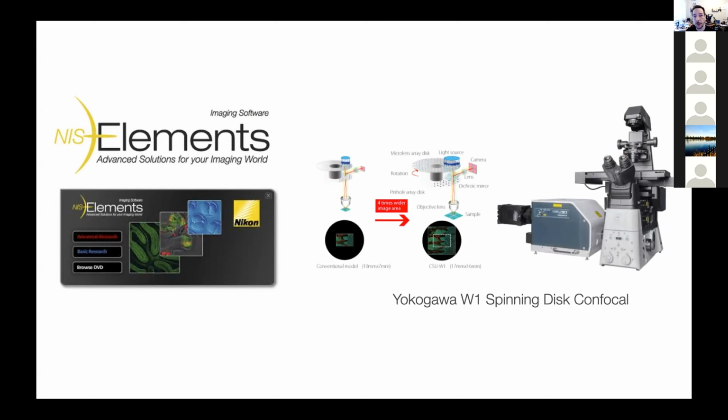And it's really a perfect system for this because it has very high sensitivity sCMOS cameras. So we have a large field of view, we've got a lot of sensitivity, and we can image optical sections very quickly in tissue and in cells. And so when you start doing things like that, you can start to think about your research in a different way. Instead of sitting at the microscope and manually collecting data, you can start to think about automation and then thinking about what it is you actually want to get from that data, and then start to develop an imaging and analysis pipeline that really targets getting that information efficiently.